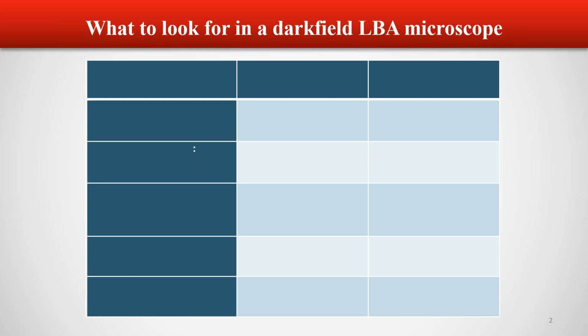If you don't have any one of those features on the microscope, you'll find that there will be a compromise in terms of what your samples will look like and what you will be able to see in a sample. And of course, that then will impact on your success in practice. If you're not able to see all the anomalies that you should see, you won't really be able to make an accurate analysis, and you won't be able to implement the correct interventions either in your clients.